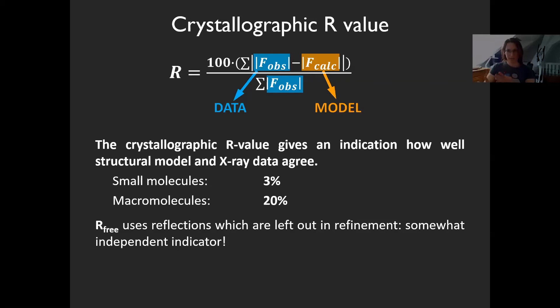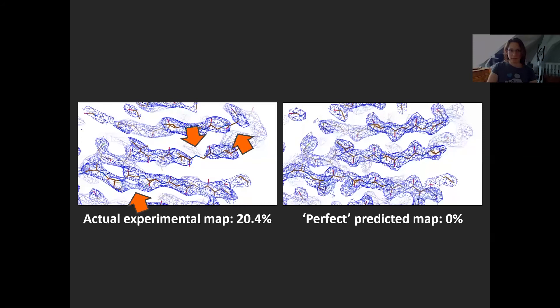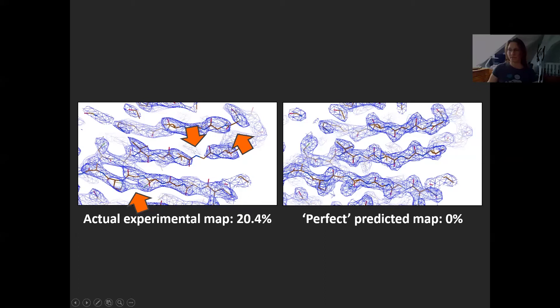Here's another example. What we would want but can't have is a perfect map — that would be an R value of zero. If we calculate the map with a model that is not perfectly fitting the data — for example 20.4% — you get artifacts. The backbone density is not consecutive, there are some gaps, and two points are merged. So it's not great.